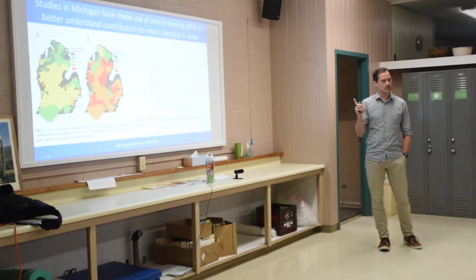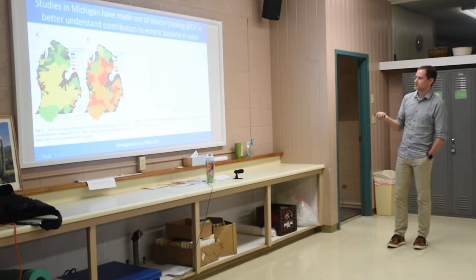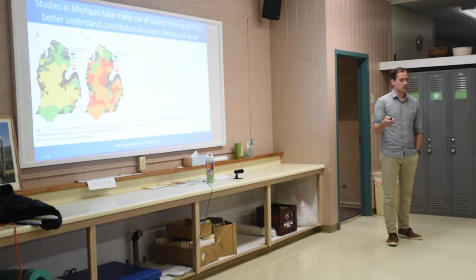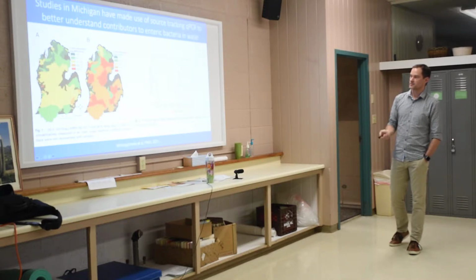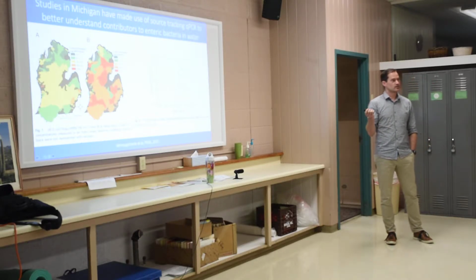And remember, only a single time point here, but when they then took the land use data and they looked to see the density of septic systems in each of these different regions, I'm assuming counties, sorry, I don't know, regions, watershed, sure. And then you map B theta concentration on the y-axis. You can see that for the places where you have high septic systems, you have higher B theta. Okay, so we know that when you have high septic system concentrations, it doesn't matter how old they are, it doesn't matter what the deal is, concentrations of septic systems correlate strongly with the presence of human marker in these rivers, at these watersheds.